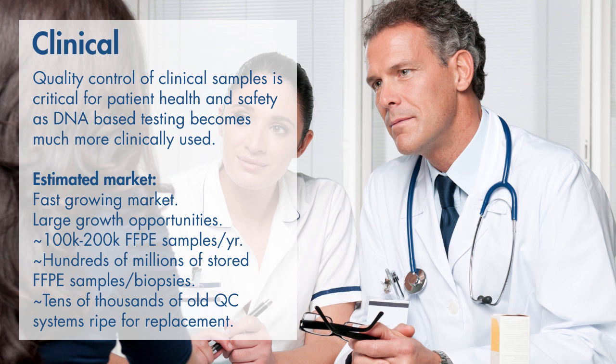Another example is the clinical market, which is already fairly large and poised to grow larger over the next several years. As mentioned previously, one important subsegment of the clinical market is that of FFPE samples, with hundreds of millions of samples stored in clinical biobanks around the world.